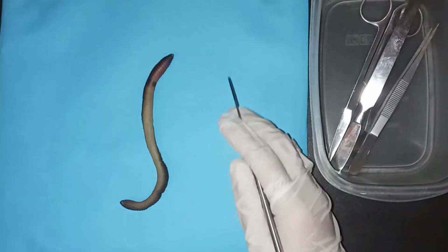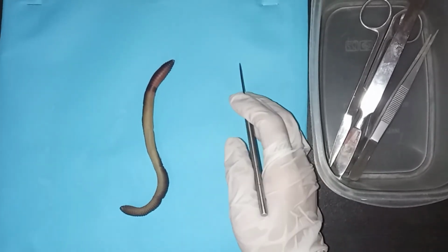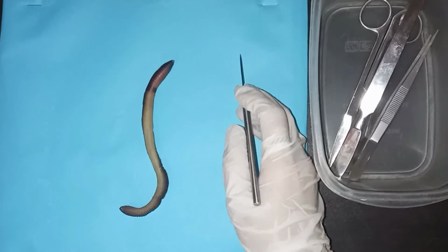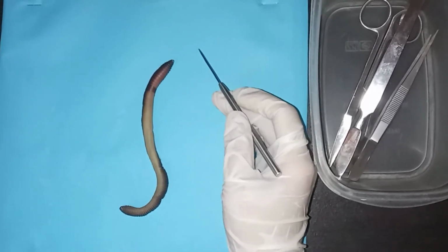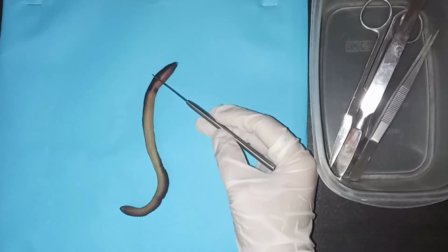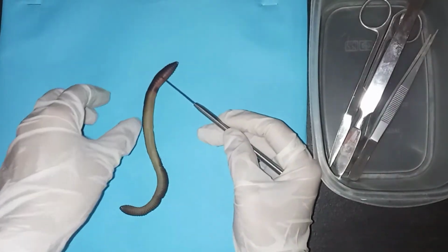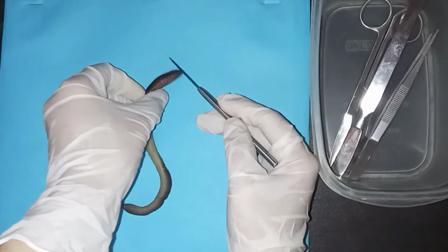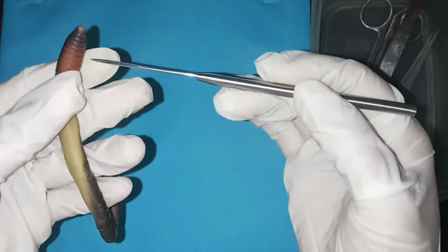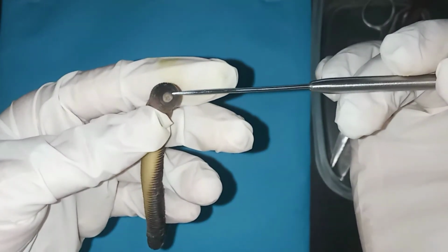At first glance, we always thought that both ends of earthworms are the same, but earthworms do have an anterior end and also a posterior end. This upper part is called the anterior end. It is the one that is closest to the clitellum. It is also where the mouth of earthworms is located, in the first segment. So this is the mouth of the earthworms.